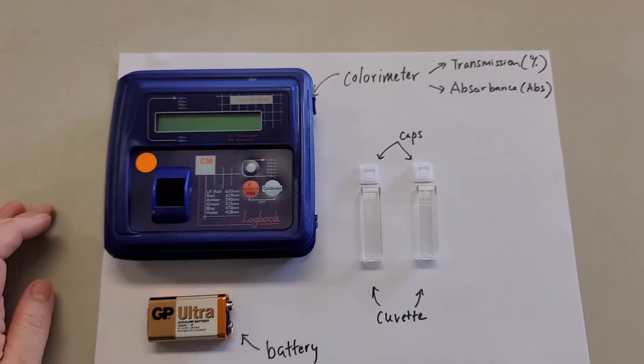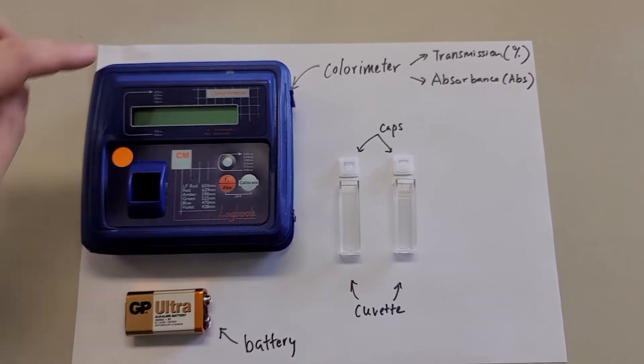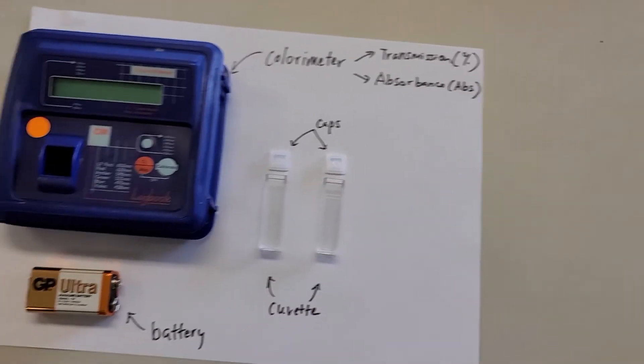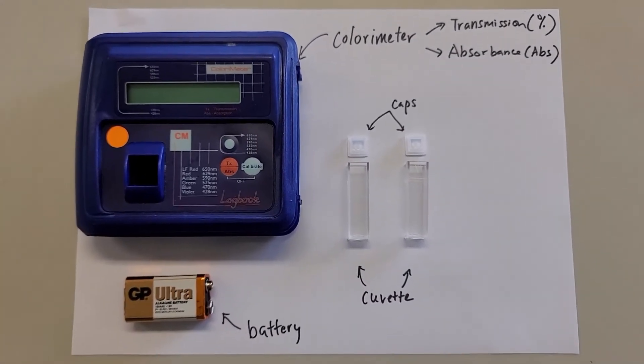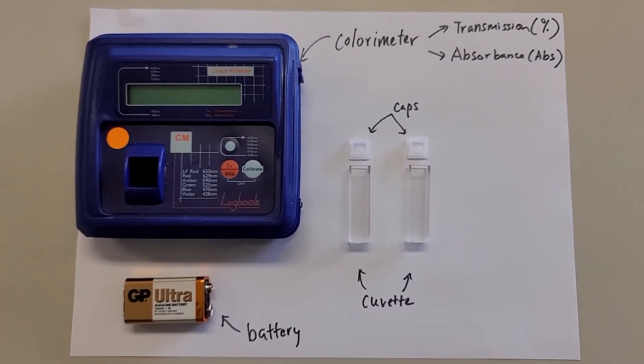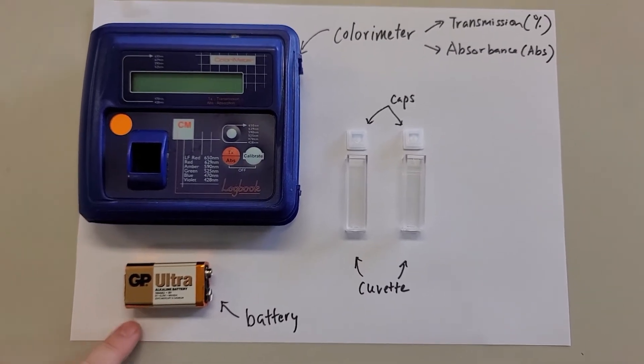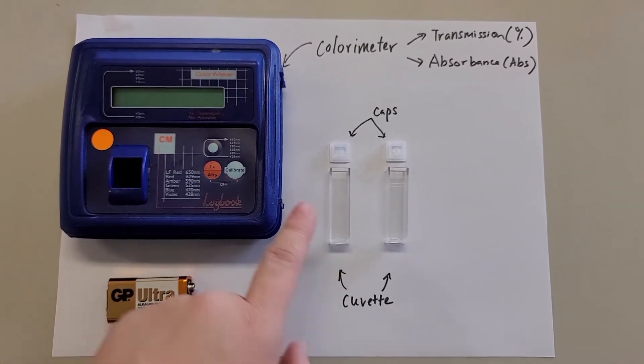So first of all, you will need the colorimeter. The colorimeter has two functions. One of them is transmission, the other one is absorbance. And then you will need the battery, a cuvette, and the two caps.